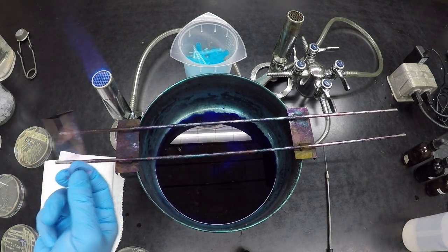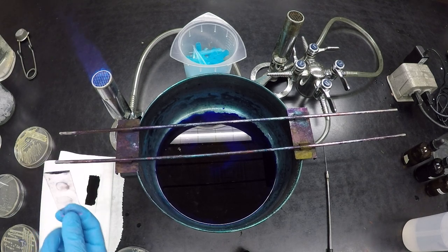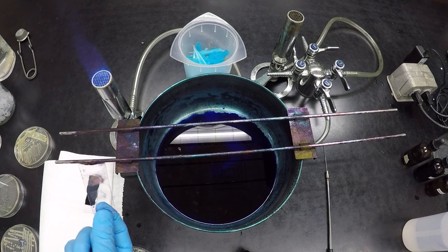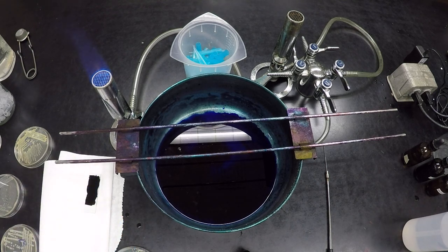Now this contains bacteria, right? The bacteria that we just pushed, so this should go straight into the discard. So I'm going to disappear for about 10 seconds while I walk this over to the discard bin.